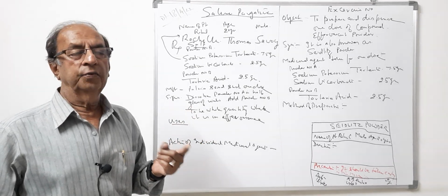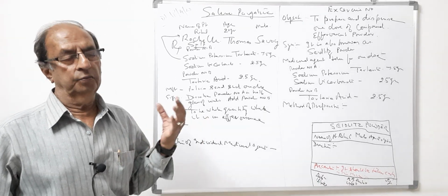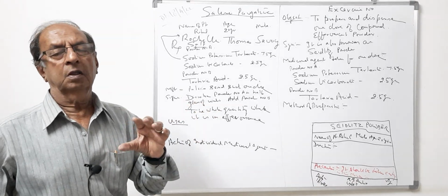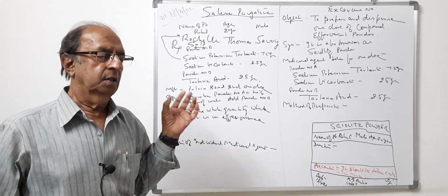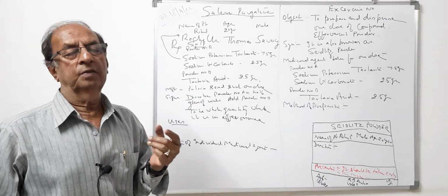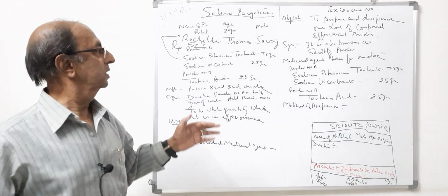and this tooth powder is very important. You are going to prepare it. The components which you are going to mix, there are several components in the tooth powder. In the laboratory, all chemicals are fresh that can be used by you people. So that powder you are going to prepare next to this.